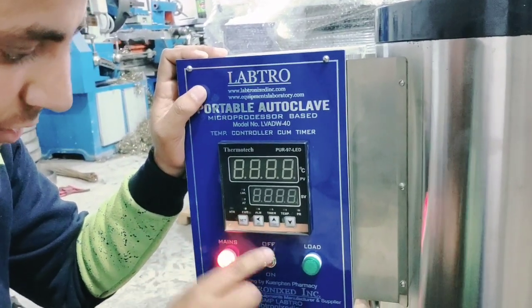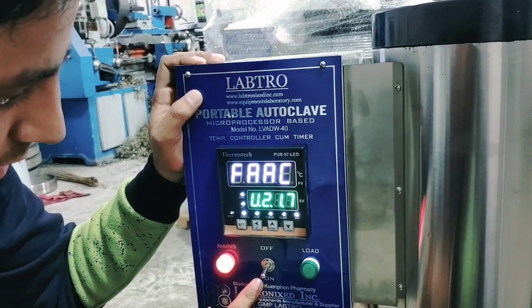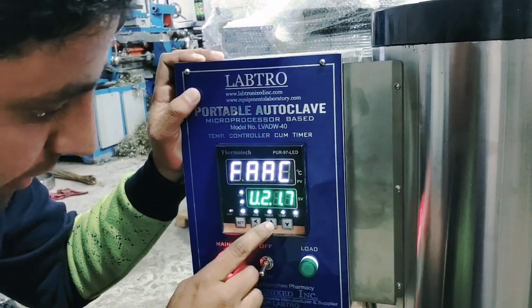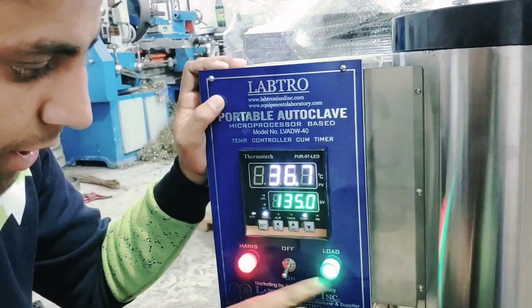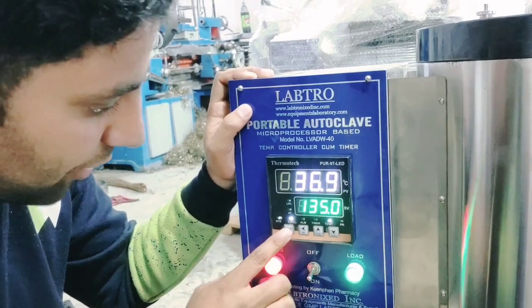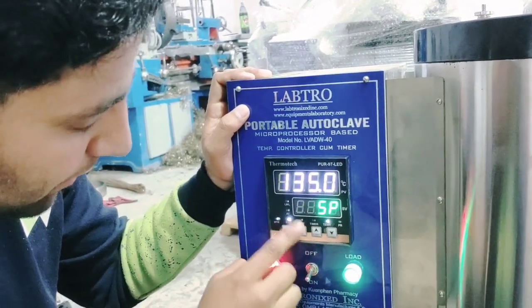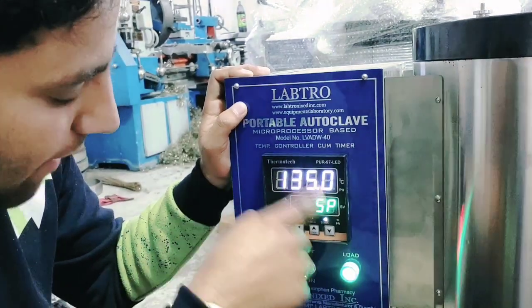We will make the heat, then we will add the on/off button, then we will add the start button for a few seconds. Then we will start the heating element, which will set the temperature for a few seconds.